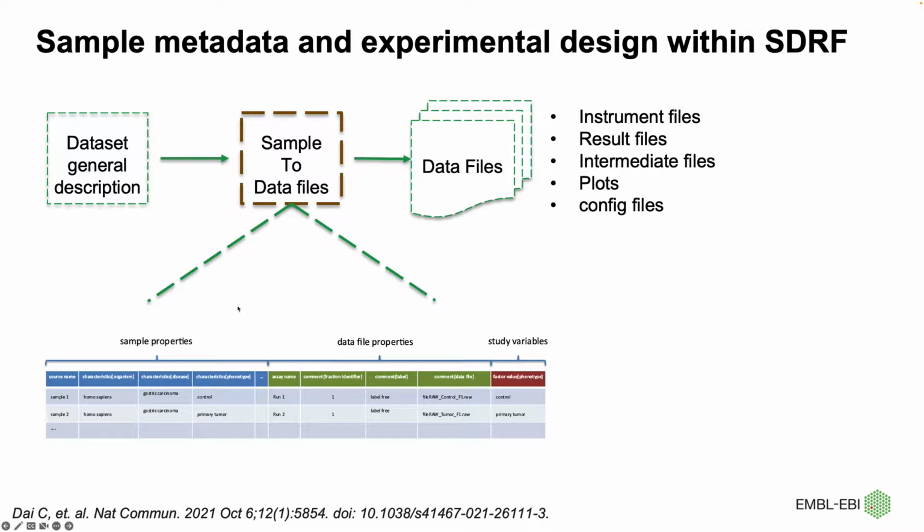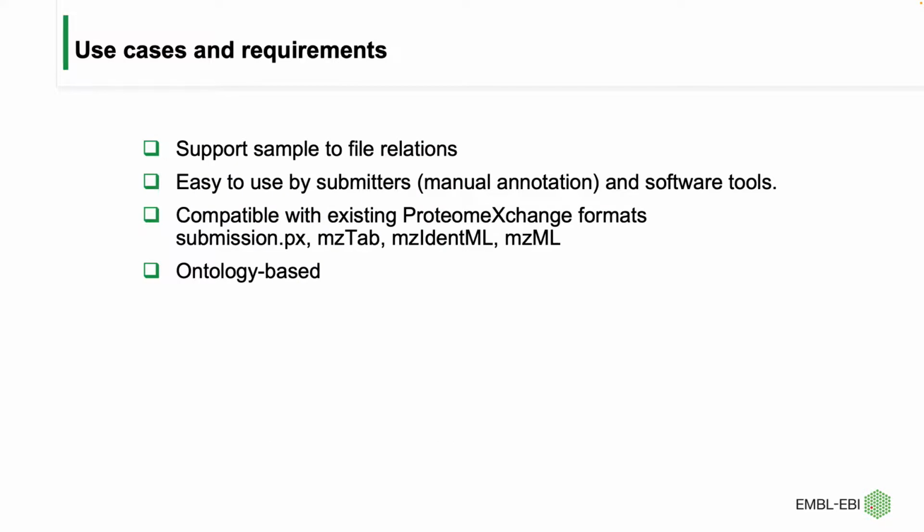Let's call it this: a file format that tries to model the experimental design, but also captures a lot of metadata around the samples and around the file itself. In this short presentation, I will try to explain the main advantages of this file format, and I will show some examples of my own annotated datasets and how they are triggered with Quantms, which is the main objective of this course.